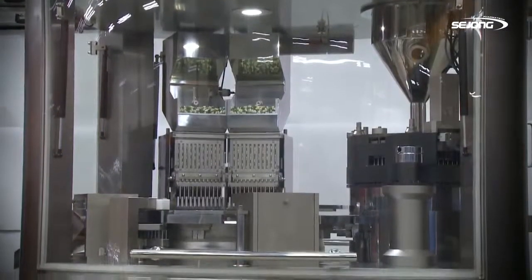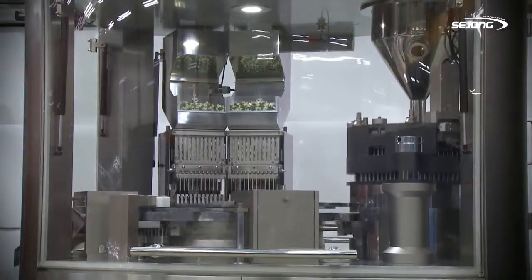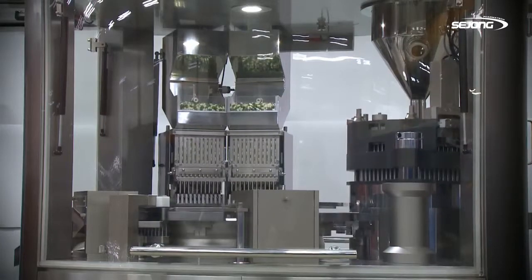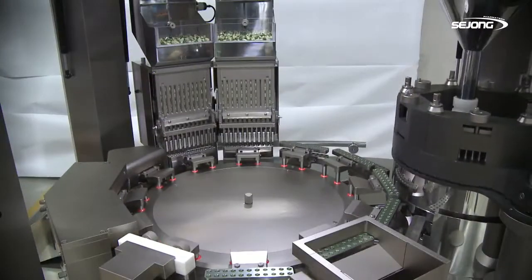The biggest advantage of Sejong Pharmatec's Automatic Capsule Filling Machine is that the amount of pharmaceuticals being filled in a capsule is absolutely precise.